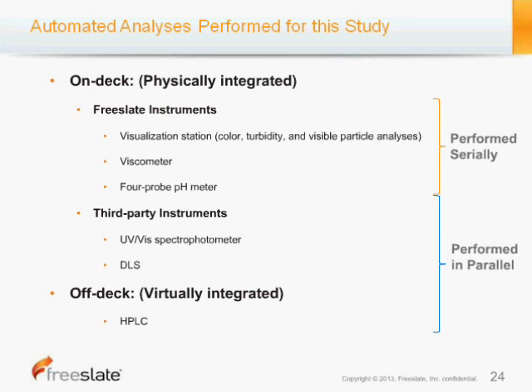And so here what we did, as I mentioned before, once the formulated materials are capped, we use the visualization station to perform the color, turbidity, and particle analysis. And then we open up those vials and aliquot out, and then we can perform our viscometry and our pH serially, but in a fully automated fashion. And so that basically has to be performed 1, 2, 3.